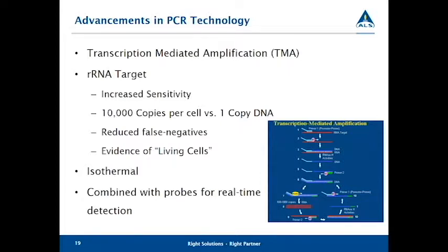Well, there's various ways for that to happen. In the initial reactions and some of the early PCRs, there was no stop point. It just ran until the heat cycle completed, which stopped the replication. So your initial amplification products may actually be longer than, say, 200 base pairs. But as you continue on cycling, eventually those become shorter and shorter, until they ultimately get to the point where you're only replicating between the forward and the reverse primer.